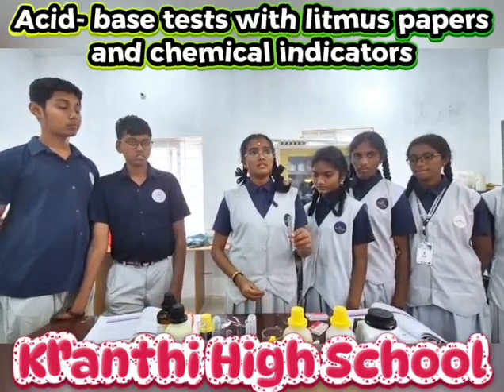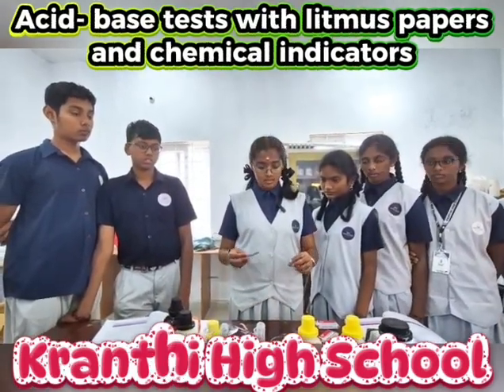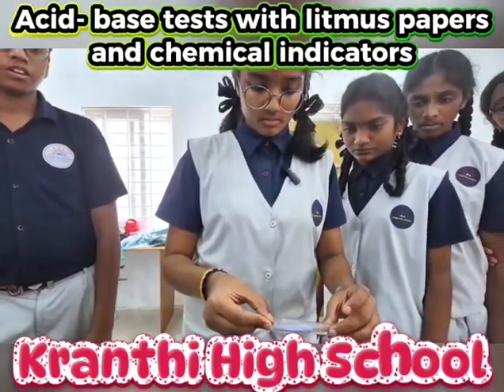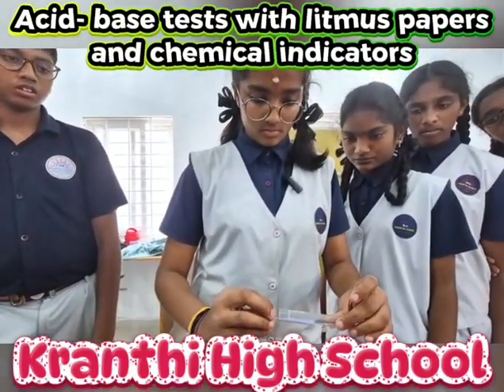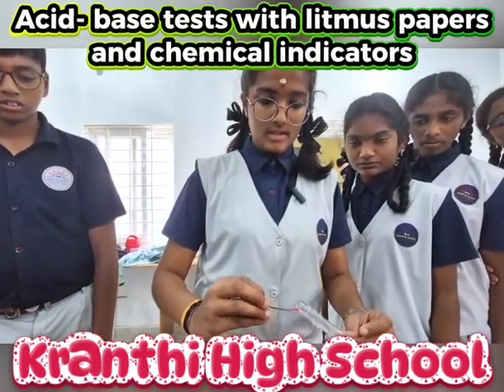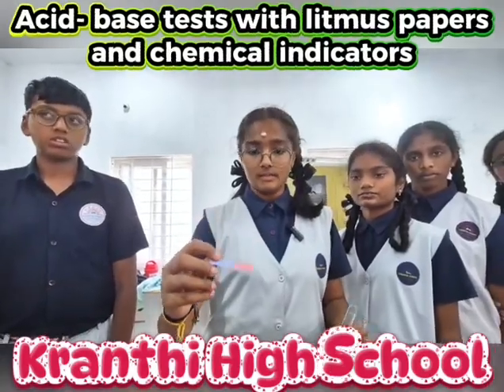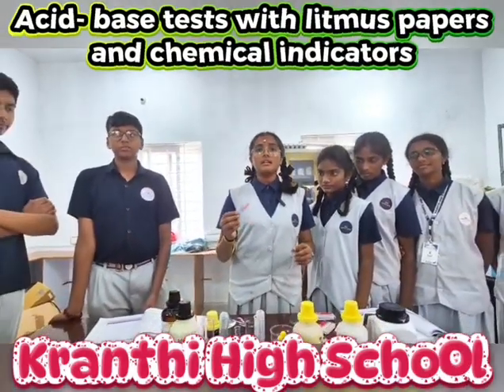It is nitric acid which is diluted. Now let us dip blue litmus paper into it. As you see, the blue litmus paper turned into red. It shows that it is an acid.